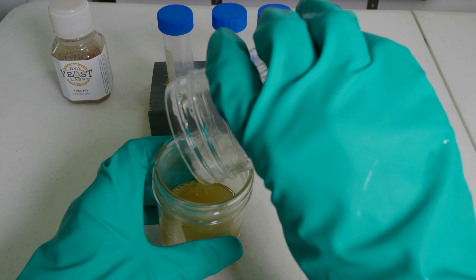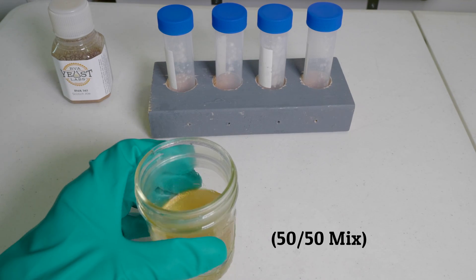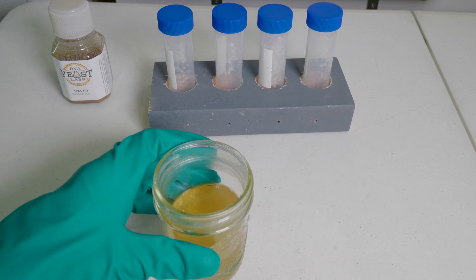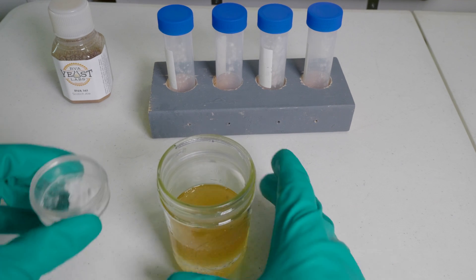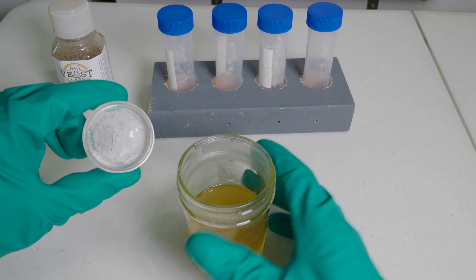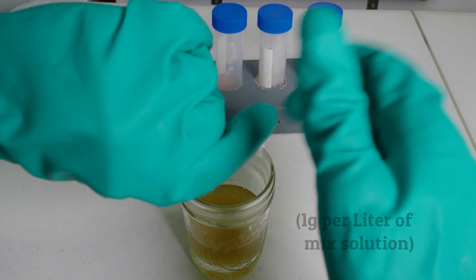I'm adding the wort to the glycerin. This is a 50-50 mix. In this case, it was 100 milliliters of wort and 100 milliliters of glycerin. I'm going to add the ascorbic acid. This is 1 gram per liter, which ends up being a pretty small amount.